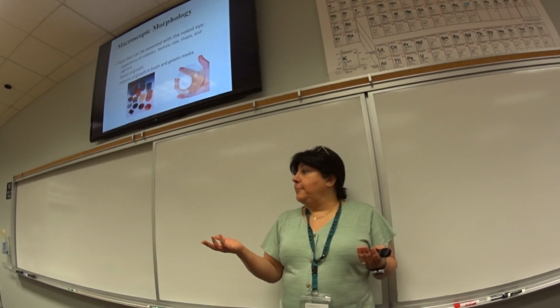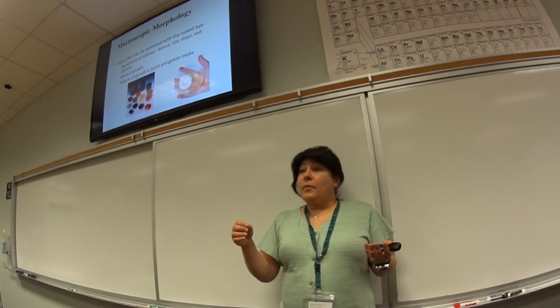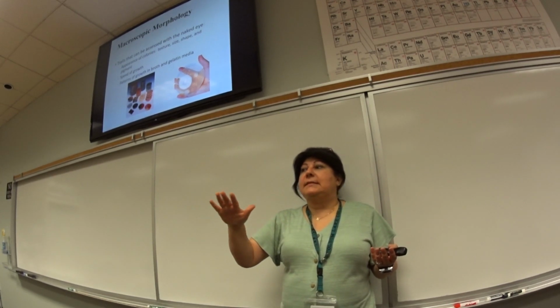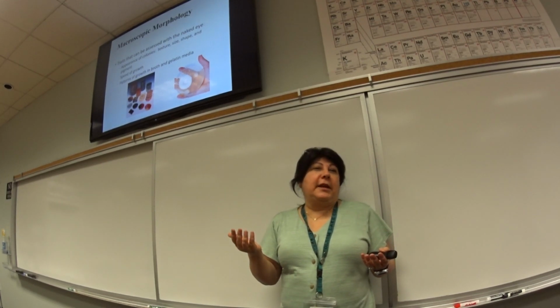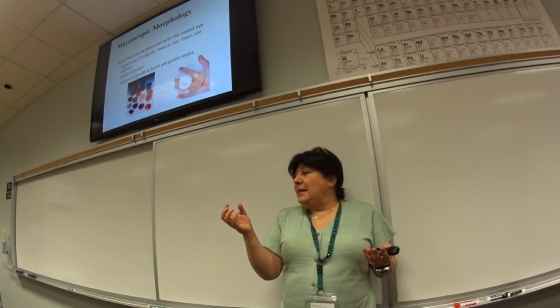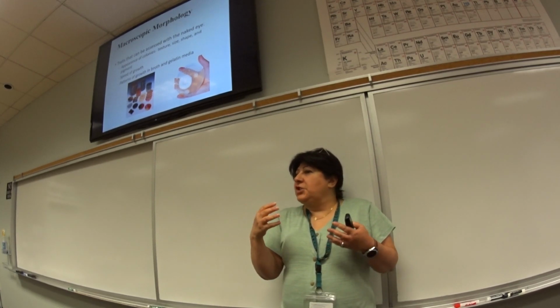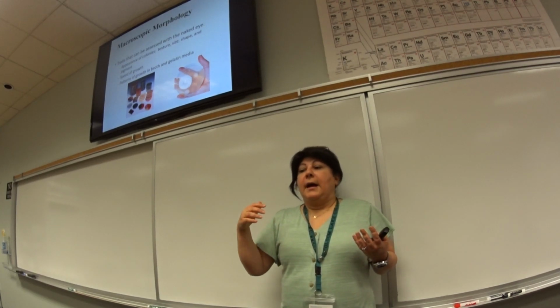Like for example, for the things that we have looked at so far, Pseudomonas aeruginosa has a gray color to it, and it releases a green-gray color into the media. Proteus vulgaris, I've been showing it to you guys constantly. It makes the media look a sick yellow color. It's just how it grows. It causes the media to look like that.